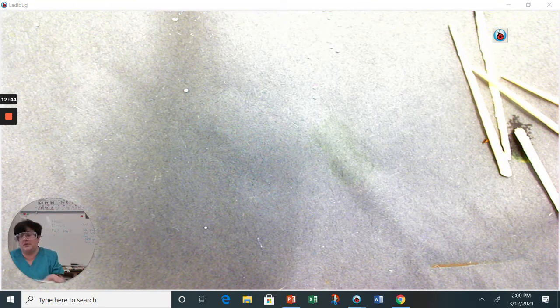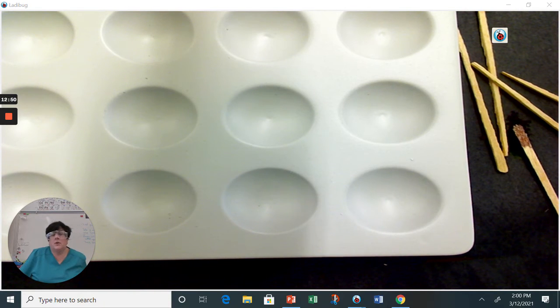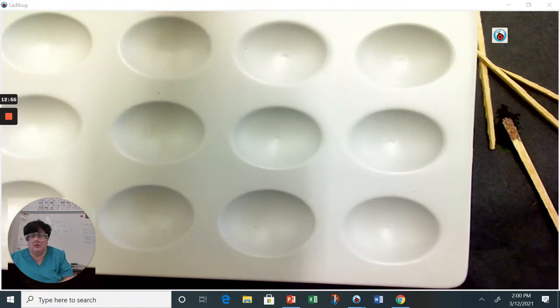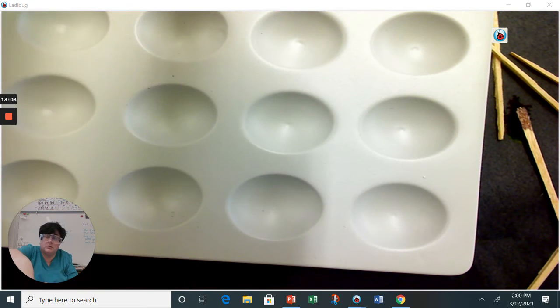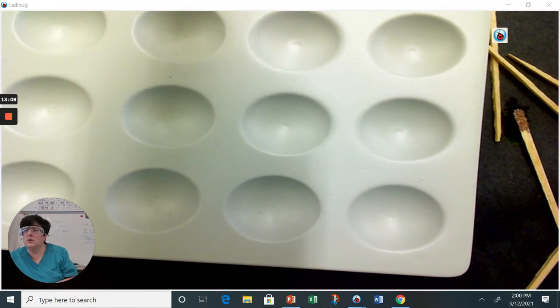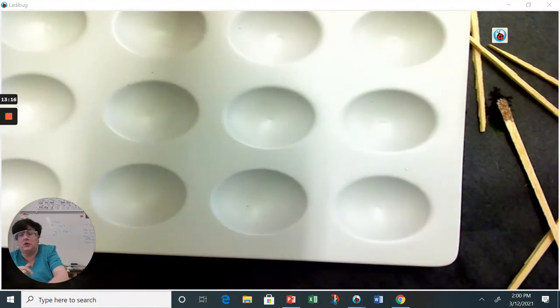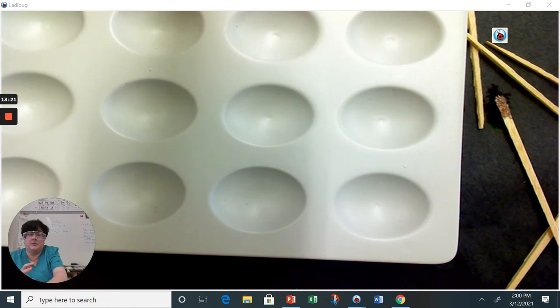When I use it in AP chemistry, the solutions get filtered or evaporated depending on what I'm using, and we lab pack it out. For this one, because we have so many people doing the testing, I use a simulated one. Oh, here it is. Guys, usually potassium chromate, the chromium is bright yellow, so this is a simulation. That's why if you go onto chemistry lab and you're like, wait a minute, that doesn't look right for chromium, that's because this is simulated chromium.